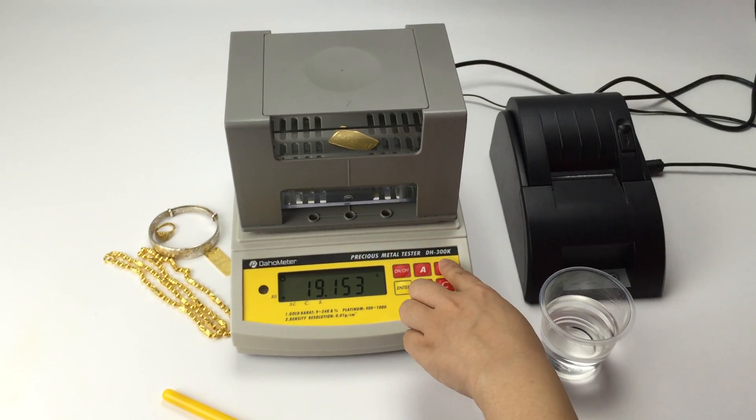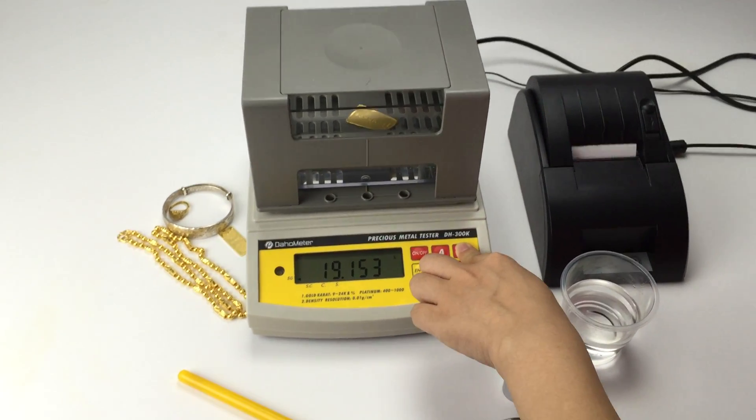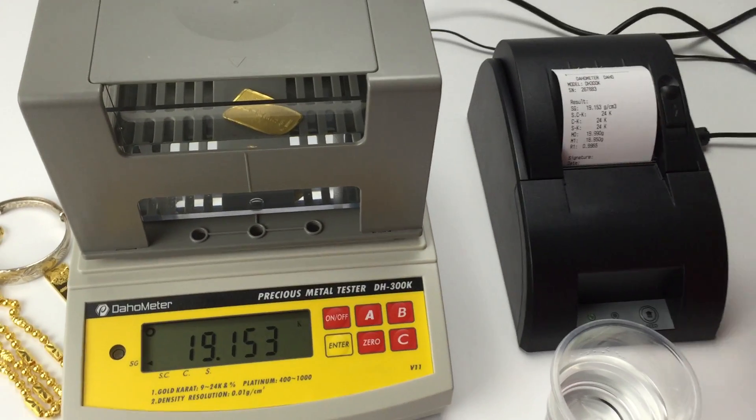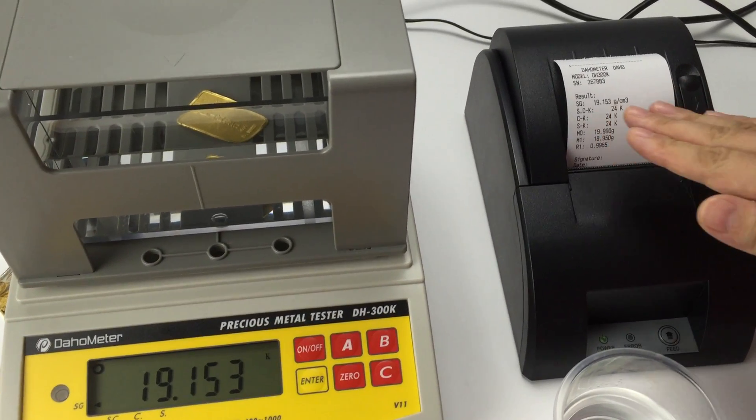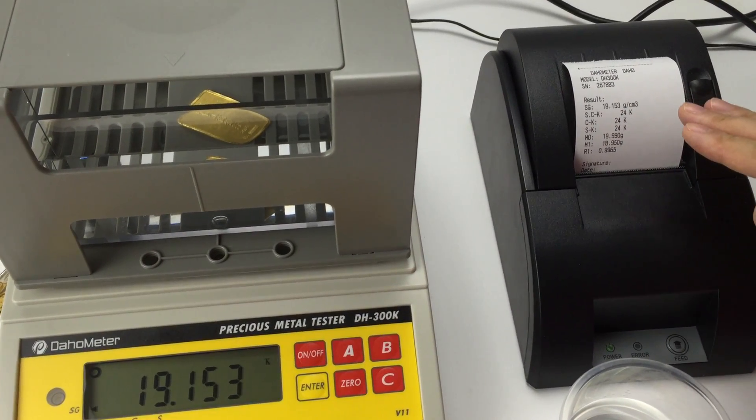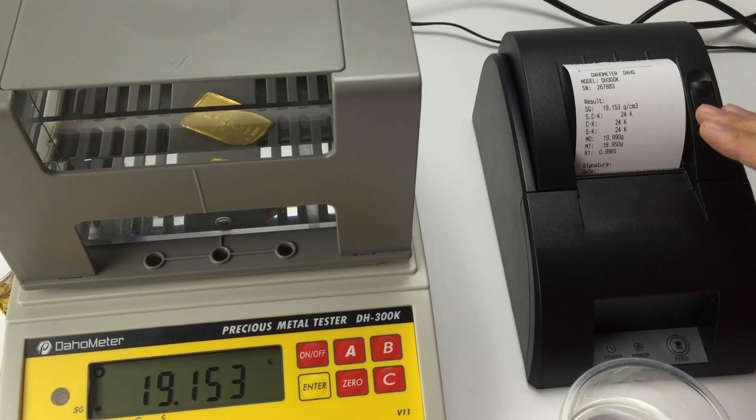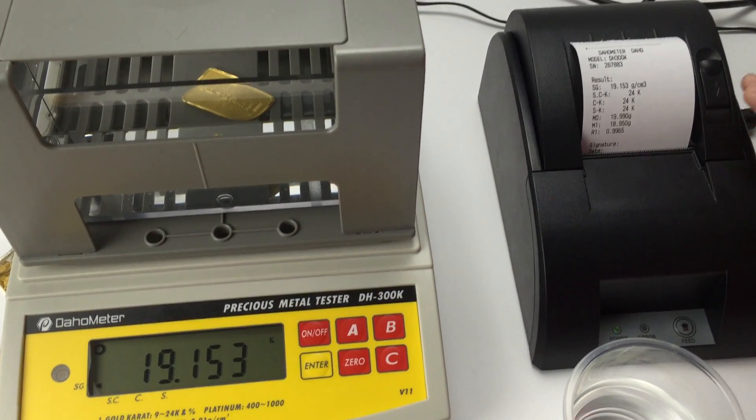And then press B to print data. The first data is SG, specific gravity. It is the density for this sample.